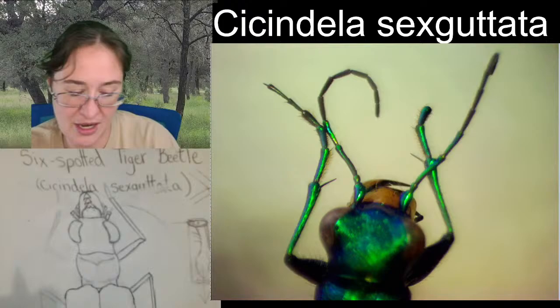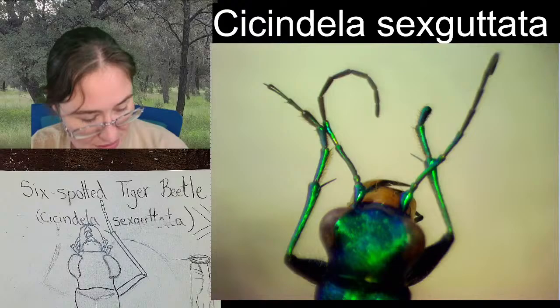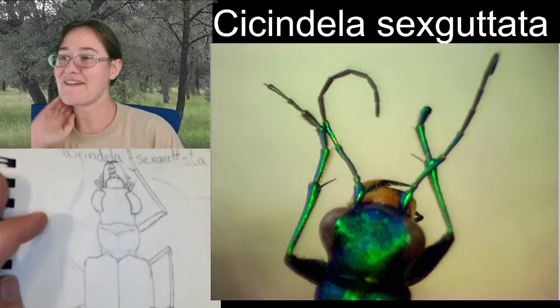So you want them to kind of meet at an angle like that. All right, so that's our tibia. Our tibia still has two tibial spurs, but you can only see one. And then we've got five tarsal segments. One, two, three, four... five. It is smaller. That's fine. Yay! All right, so we have a front leg, a middle leg, a hind leg.